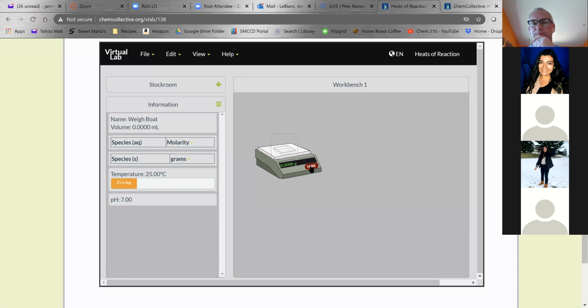Professor, I have a question. For reaction 1 and reaction 2, are we just going to use like 50 ml of the solution? Use different amounts. I think it suggests you use like twice as much the second time you go through. Okay, so like 2 grams of NaOH, 100 mL of half molar. Or 50% more, which doesn't really matter.